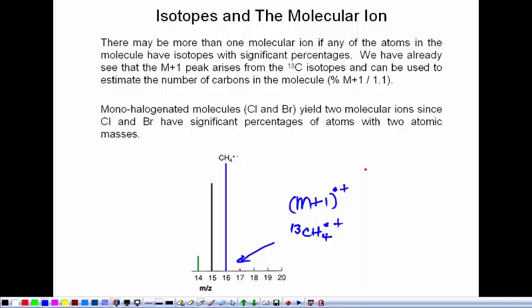Now, as I'll show you in a moment, carbon has 3 different isotopes. Basically, the carbon-12 isotope that weighs 12 is 98.9% abundance. Carbon-13 has 1.1% abundance, and the carbon-14 that's used in radioactive dating is less than 1%. It's a trace amount.